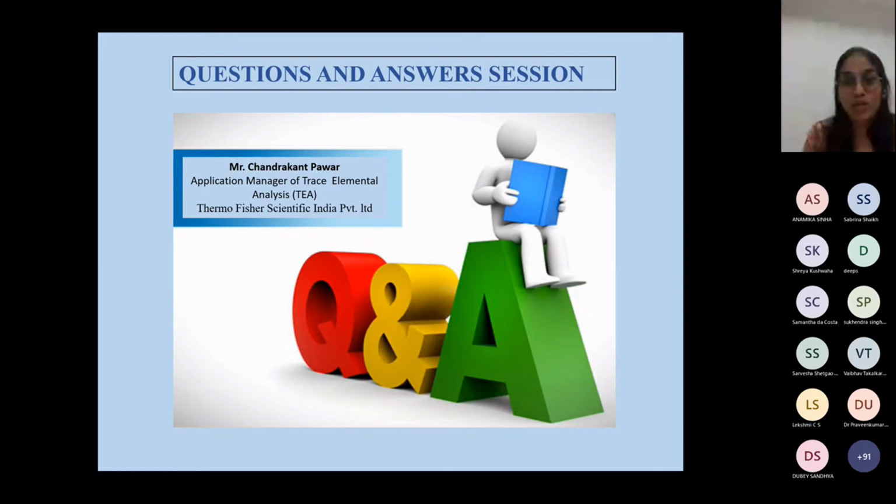Okay. Thank you, sir. So the next question is by Manikandan. He's asking, is it possible for the nitrogen value to be zero or negative? See, zero, yes, I can accept that. Negative, why would it come negative?